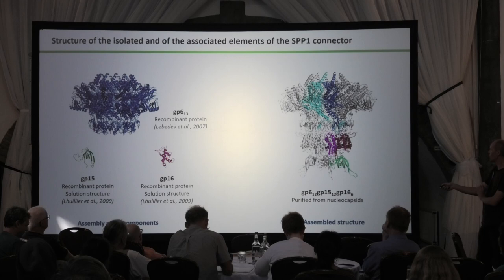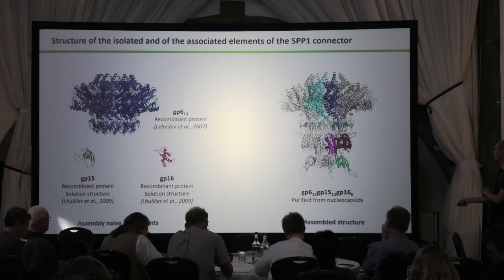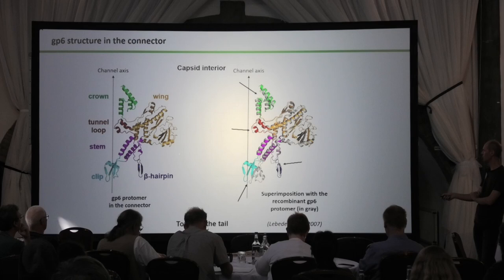So what we are going to do now is to compare these different structures, see what happens, what the conformational changes are, and try to understand how we can go from this to this. So let's start with the portal protein. This one is the one that we get from the connector.